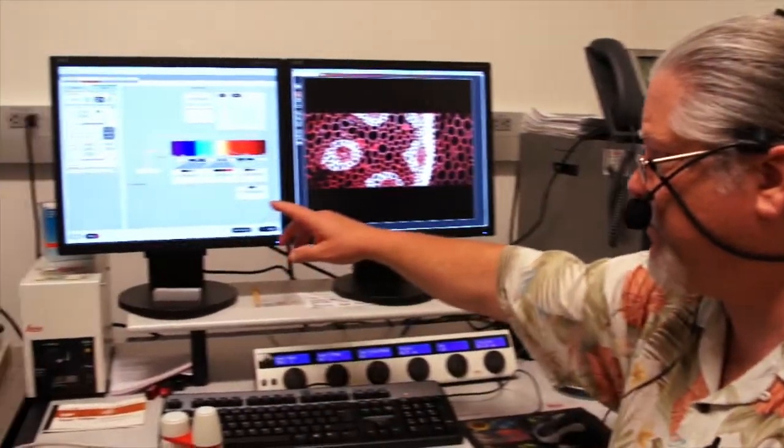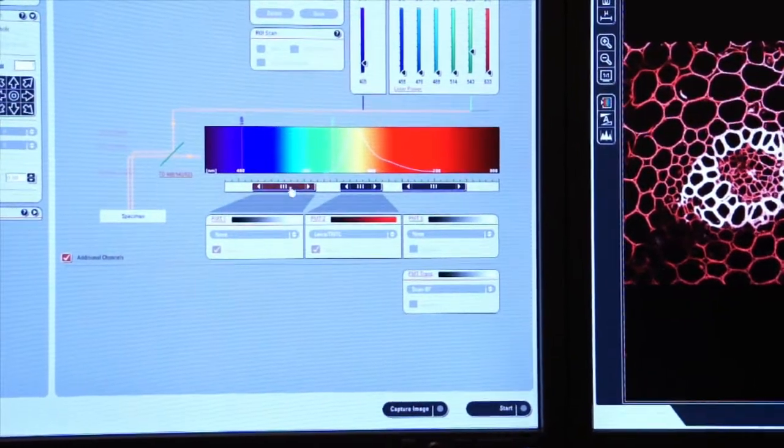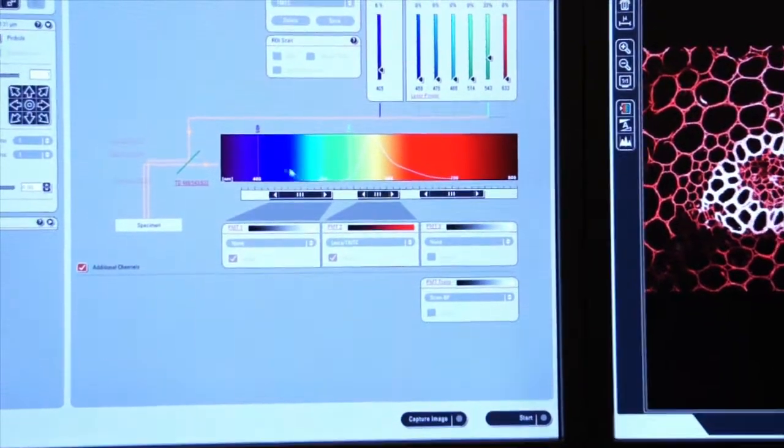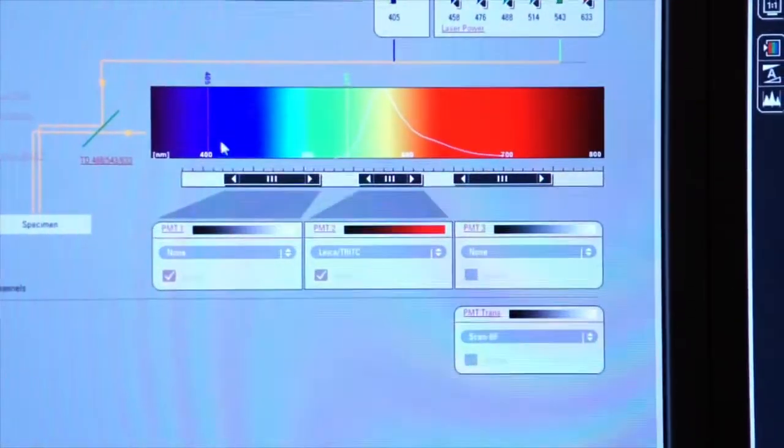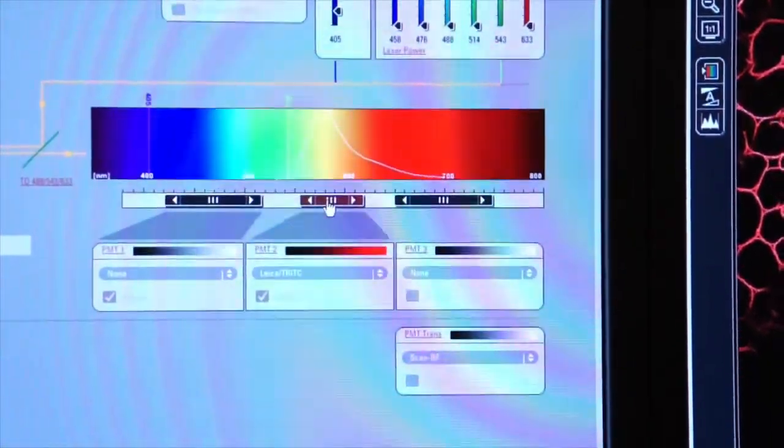That's the power of these sliding photomultiplier tubes. Looking at the left screen, we have the photomultiplier tube stretched out in an area of the spectrum that's being excited by this 405 line, and then the TRITC PMT is looking here.